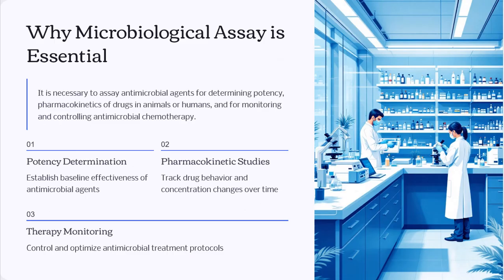Then we are discussing the needs of microbiological assays, or why microbiological assays are essential. It is necessary to assay antimicrobial agents for determining potency, pharmacokinetics of drugs in animals or humans, and for monitoring and controlling antimicrobial chemotherapy.